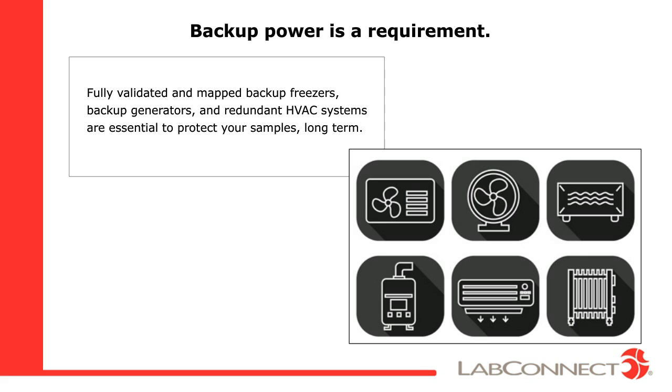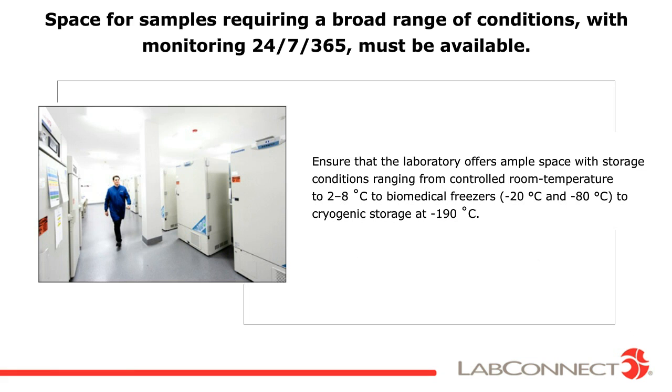Freezer space and monitoring conditions are often overlooked as critical factors. Prior to choosing a biorepository, your sample stability and storage requirements should be well understood. Verifying freezer space, temperature range capabilities, and overall capacity is important. In addition, understanding continuity plans for equipment failures will help ensure success.